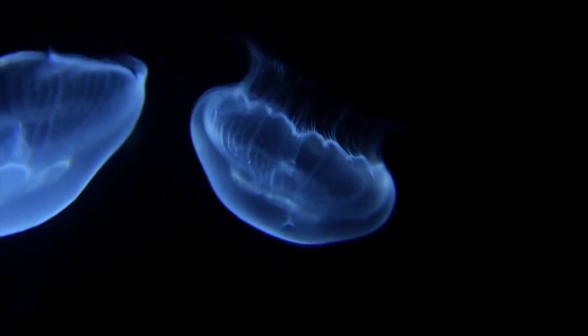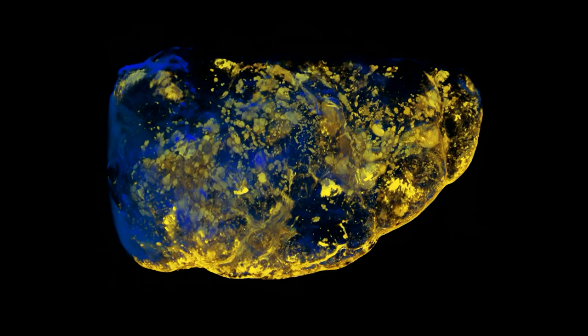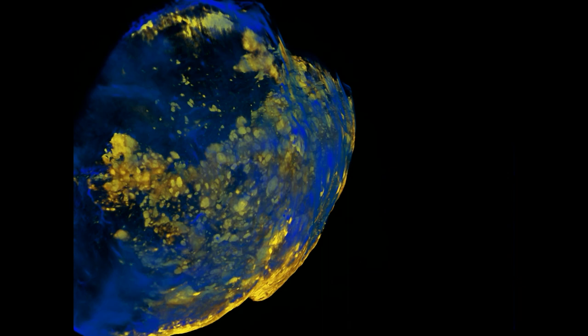Light sheet microscopy is a scientific technique which uses this transparency and fluorescence from jellyfish. It allows us to see the biological processes occurring inside the living tissue. By making the sample transparent, we can deliver light in and we can receive light out.